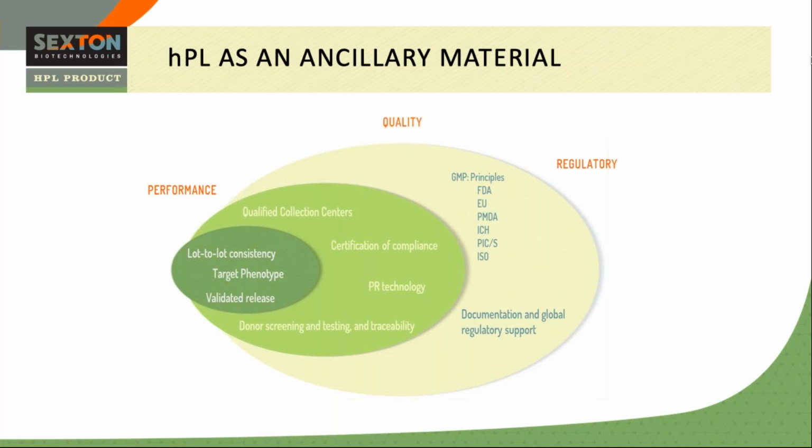The quality considerations are the same sorts of aspects as with typical quality system expectations. One key consideration is the ability to change tack with regards to ongoing regulatory developments. Certainly, European Pharmacopoeia expectations of pathogen reduction and risk assessments of viruses really made everybody consider how they were going to do this with the platelet lysate.